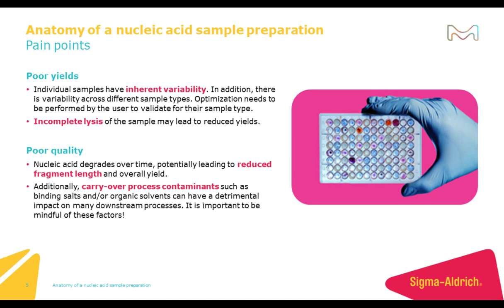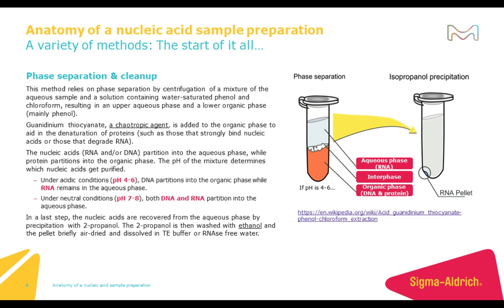Typically, optimization is required from the end user in order to validate for their sample type. Additionally, incomplete lysis can cause those reduced yields. Nucleic acids degrade over time and that could potentially lead to reduced fragment length and also impact overall yields. Additionally, you want to be careful of carryover process contaminants from sample preparation such as binding salts and organic solvents that can have detrimental impacts on downstream processes.